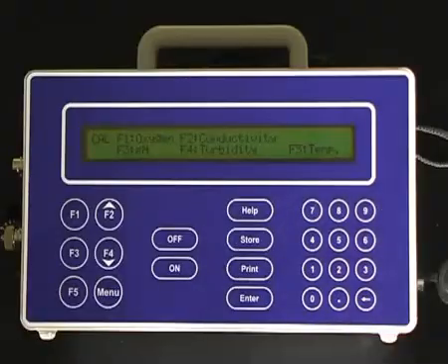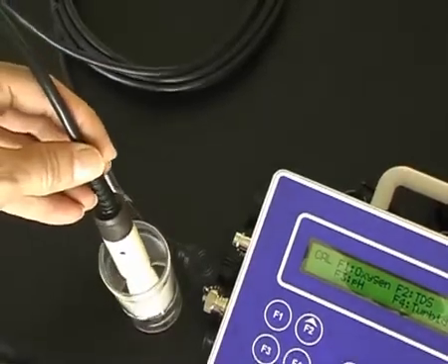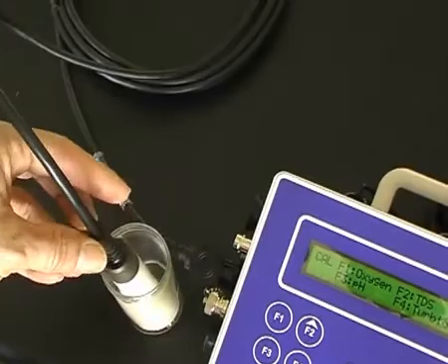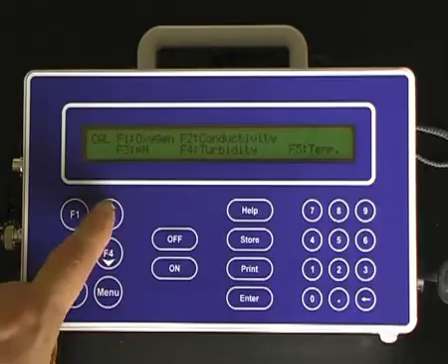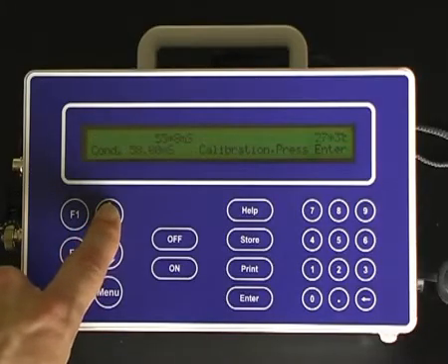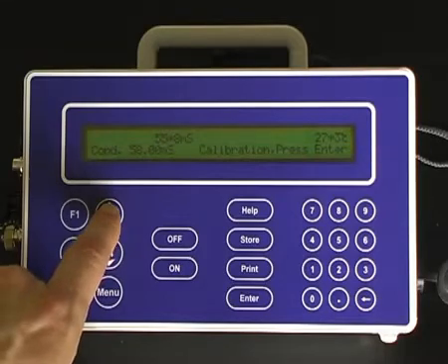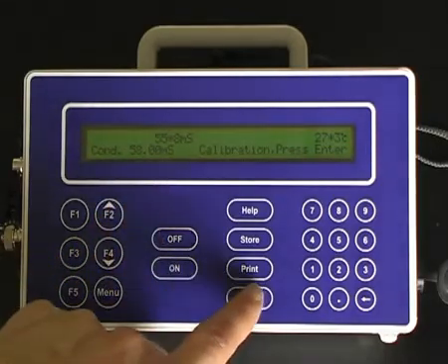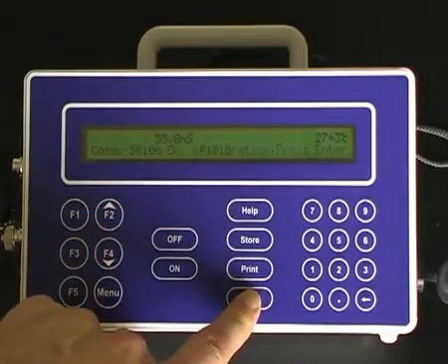For the second point calibration, ensure that the sensor is submersed past the vent hole in the solution. Press F2 for conductivity. Once the sensor has equilibrated, press the Enter button to complete the second point calibration.